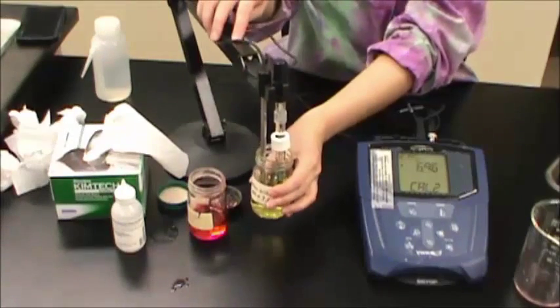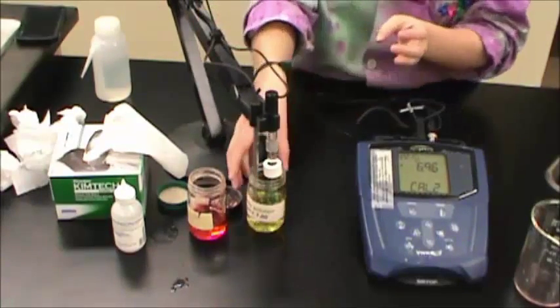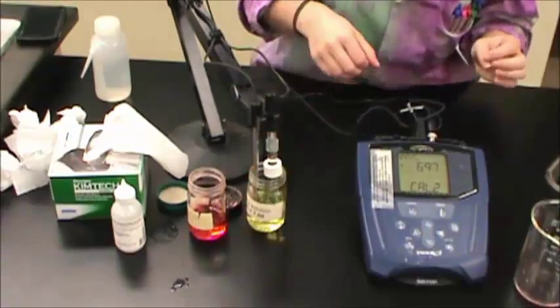Place the probes in the second buffer solution and gently swirl the container. The instrument should automatically read the correct pH.